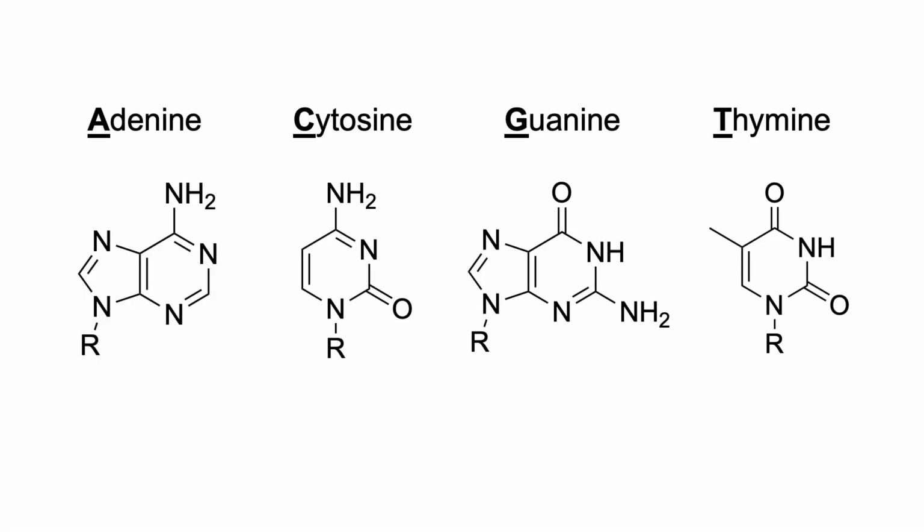In order to do sequencing on DNA, you are first going to need to know something called the ambiguity codes of nucleotides. So we have our 4 basic nucleotides, A, C, G, and T. And this is good if you know exactly that it's that nucleotide whenever you're doing the sequencing. But gels do not run perfectly.